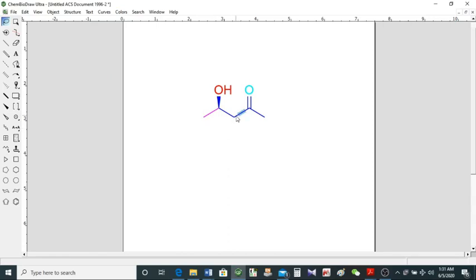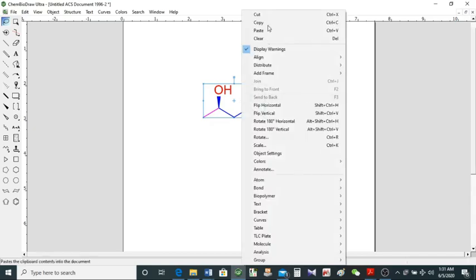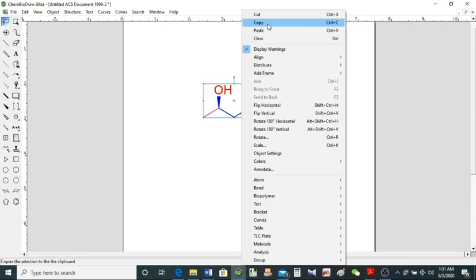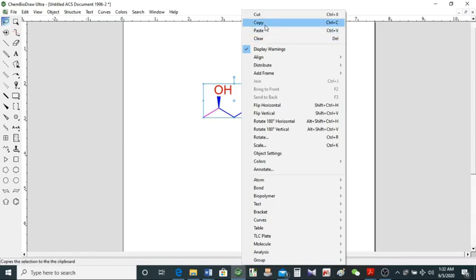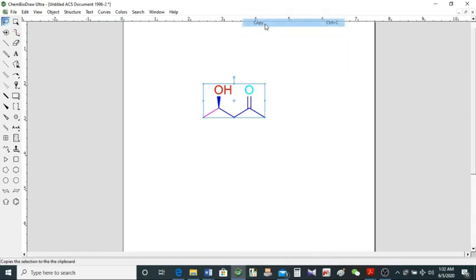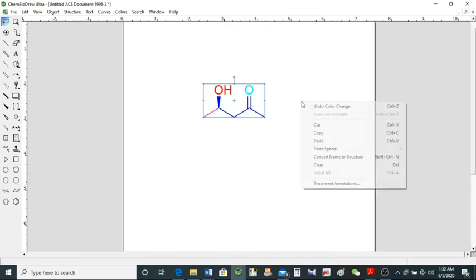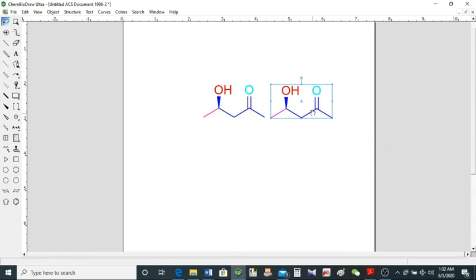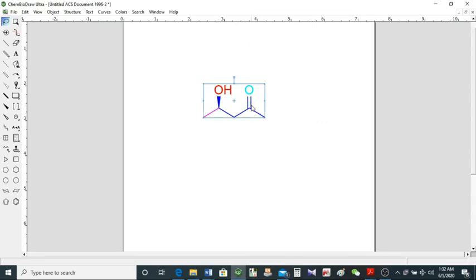Select this structure and right-click — you see a lot of options, we'll check each one. You have the cut option to cut your structure, copy it and paste it somewhere else, or delete and clear it from here. Let's try: click copy, then click somewhere else and paste from here. You can also use Ctrl+C and Ctrl+V, which is easier. I don't want it here so I just delete it.